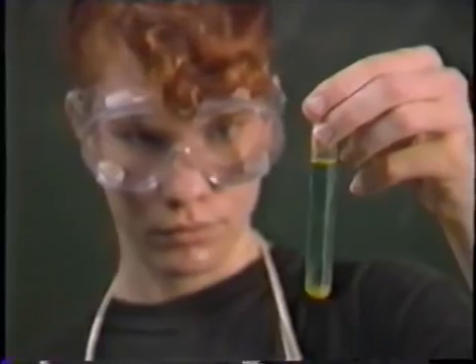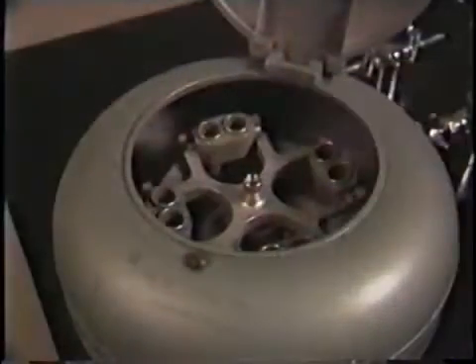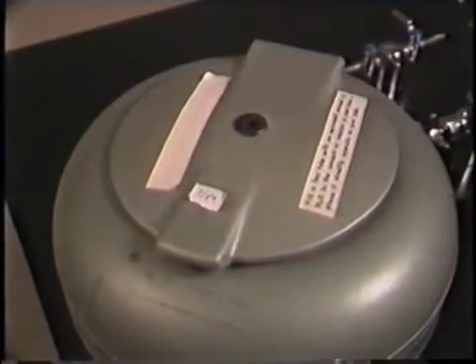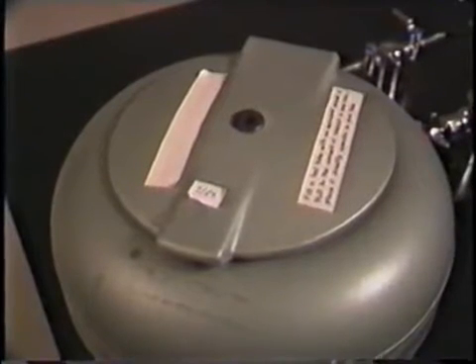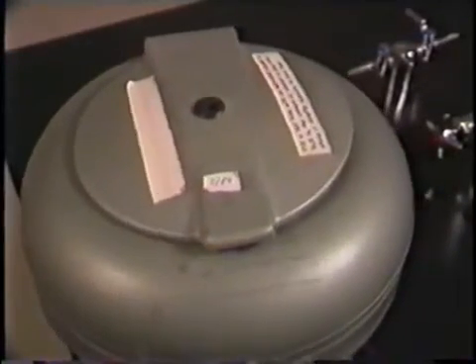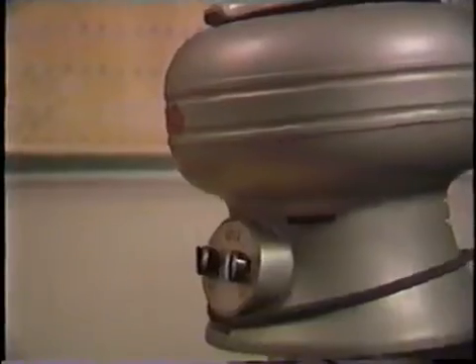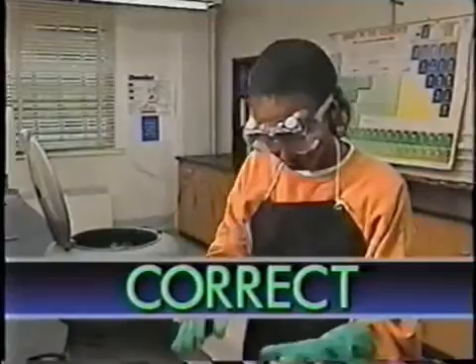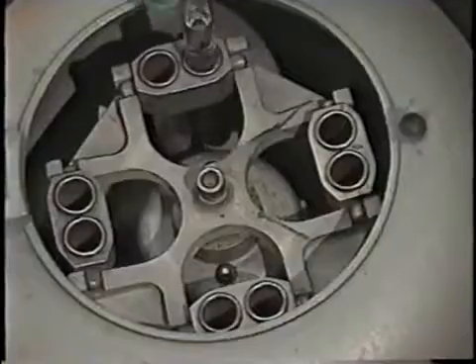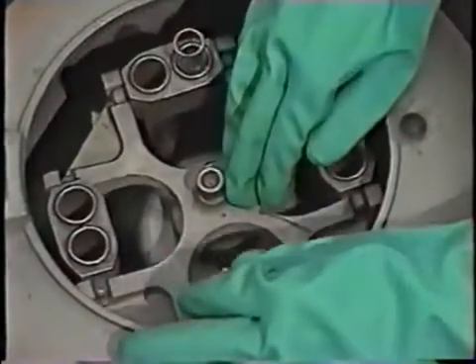When the test tubes inside aren't evenly distributed, the centrifuge is unbalanced. It vibrates like a washing machine with an unbalanced load, and if the vibration is bad enough it can fall off the bench top. To prevent vibration, a centrifuge must be balanced. If you're only centrifuging one test tube, place another one opposite it with an equal amount of water.